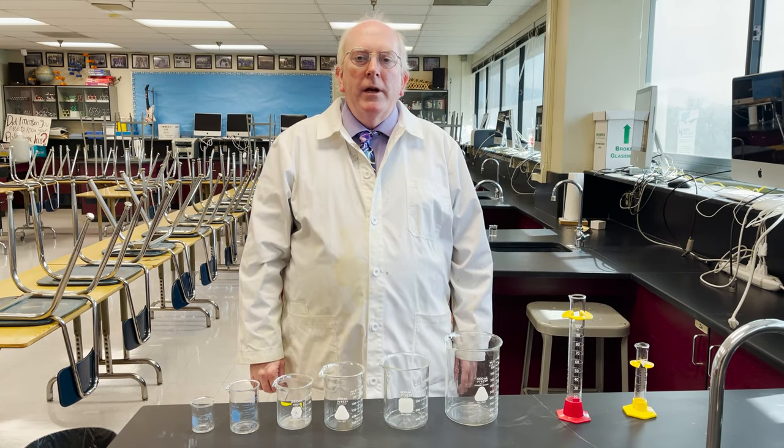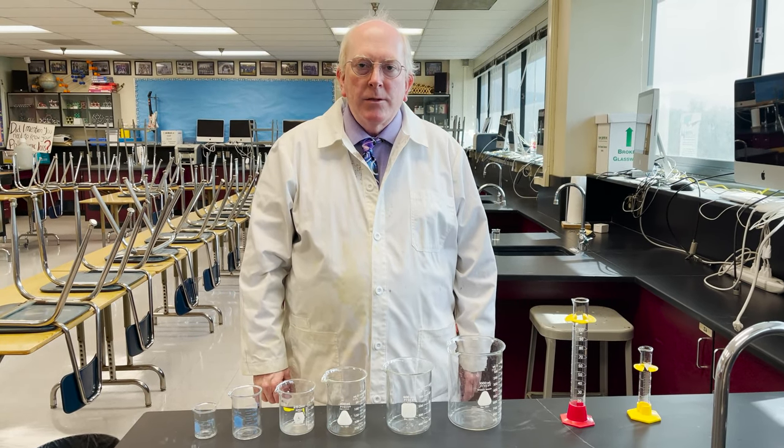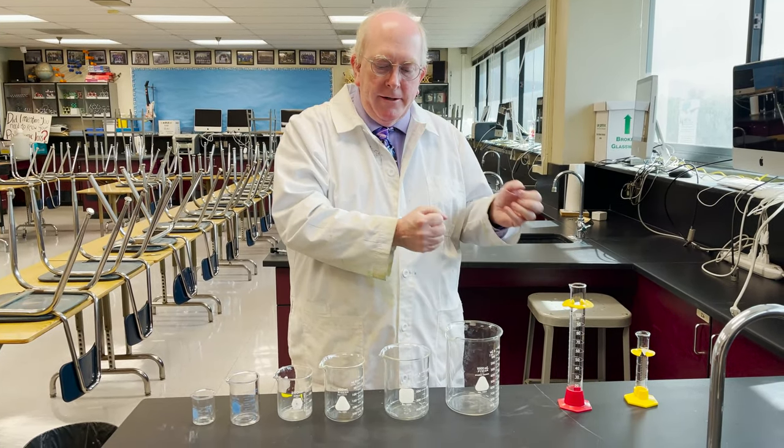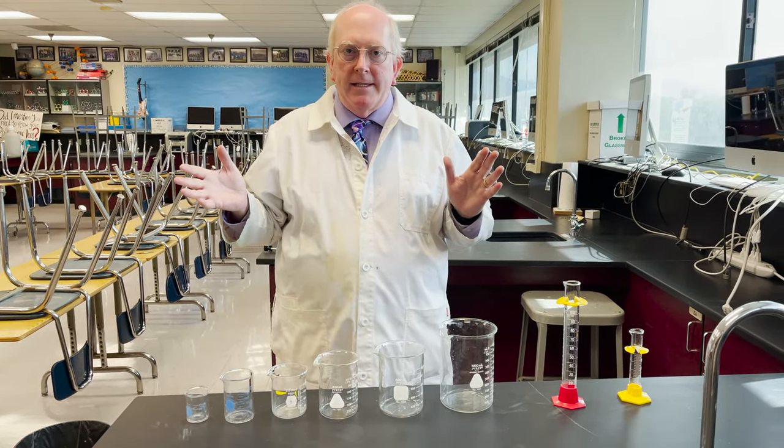Hi everyone, Morgan here. We're going to be talking about some different glassware today — beakers versus graduated cylinders — and they come in all sizes.